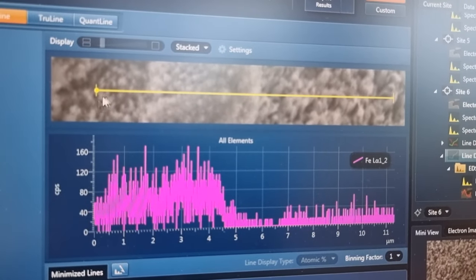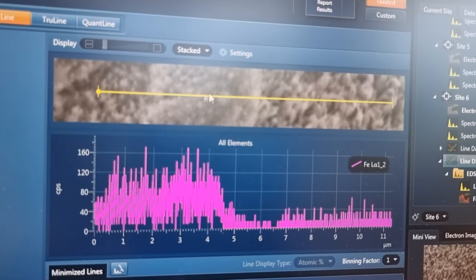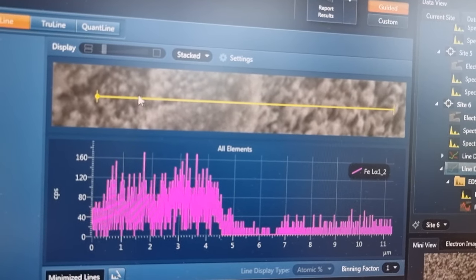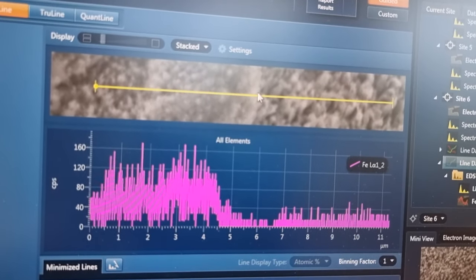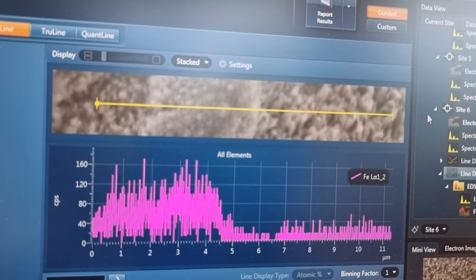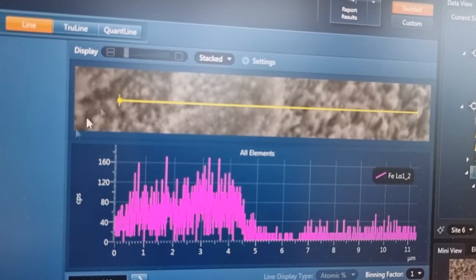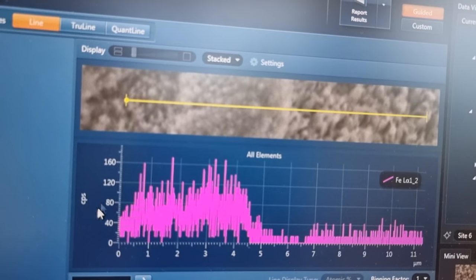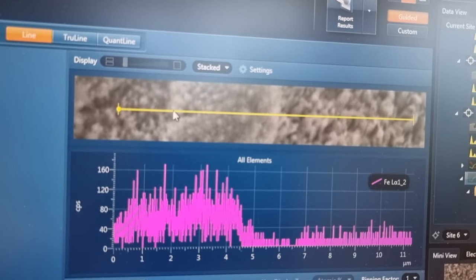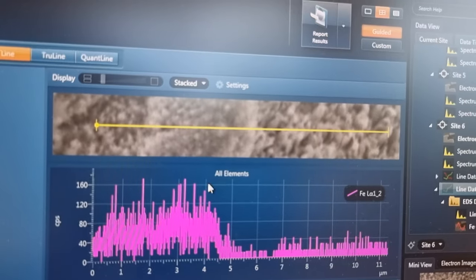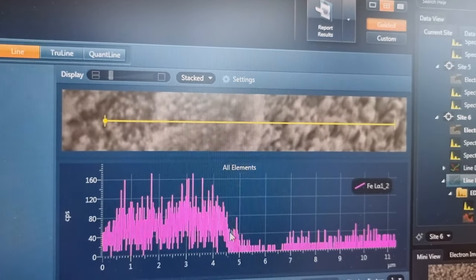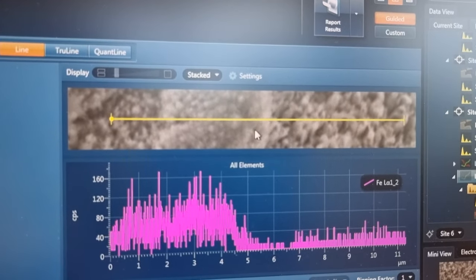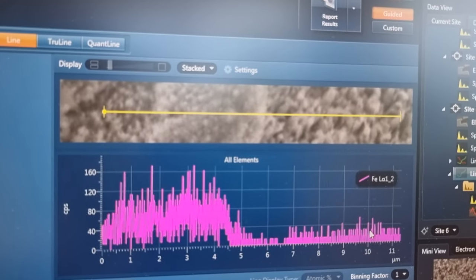We're going across the EVO strike here. This is the inside of the EVO strike, then across the EVO strike, and then on the outside. You can see the iron ramping up on the inside from basically nil to a fairly consistent level across the EVO strike width of the torus, and then it drops down to a long flat line here.